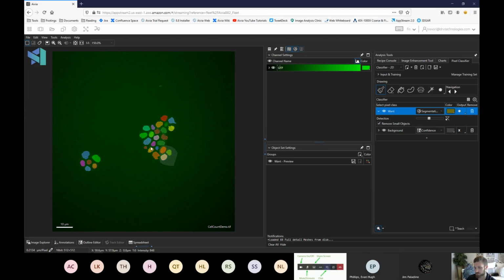Whenever I save this screenshot, I don't really want to have my paintings there. You can see here that in the middle of my screenshot, I'm going to see this painting. If you don't want to see your paintings overlaid with your preview of the results, you can deselect the tool you were using to paint. So here I had my brush tool selected. I can click that again. It'll go away, and then all my paintings are gone too. Well, they're still there. They're just not shown.